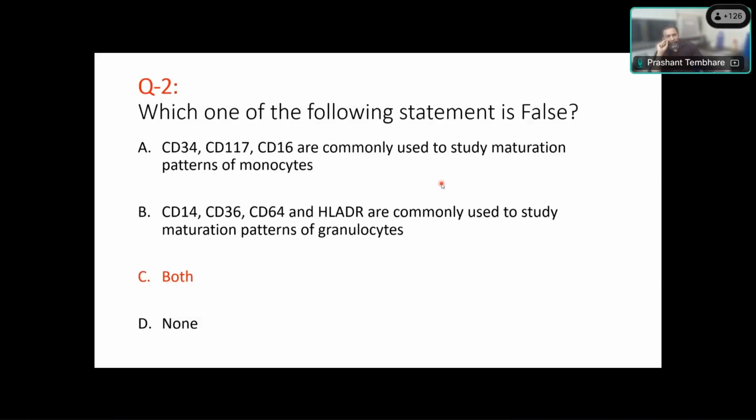So it's the same. But the moment you have aberrant genetic expression, either because of polymorphism or because of clonal genetic aberrancy, like what happens in leukemia or MDS, then this pattern changes. But normal healthy individuals, no matter where the person is, have the same. For example, CD16 polymorphism is very common. So you will see negative expression of CD16 in granulocytes. That is not abnormal. That is just a result of polymorphism.